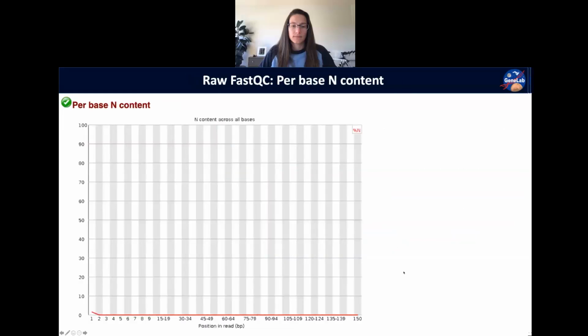Okay, so looking at the next thing here, the per base N content. I know I have 3 more slides that I want to get through for FastQC, and then we can pick up the rest tomorrow. So I might go about 2 or 3 minutes over.